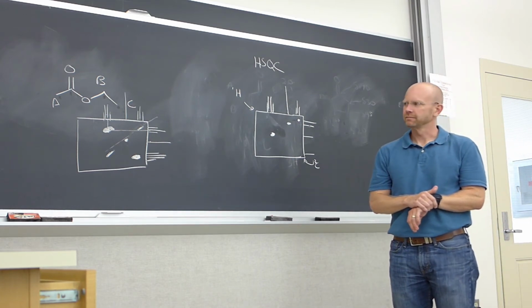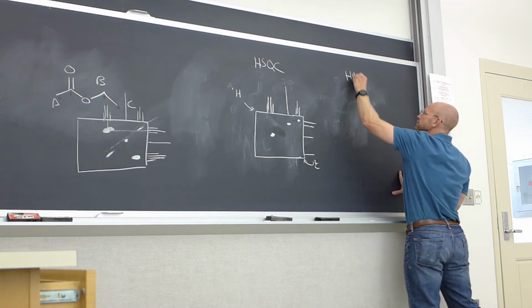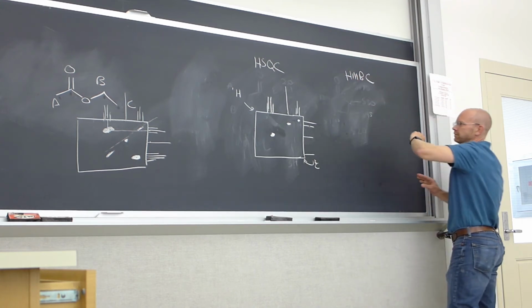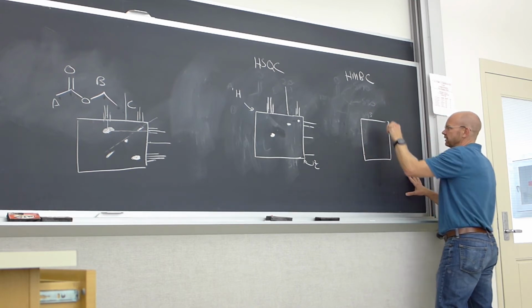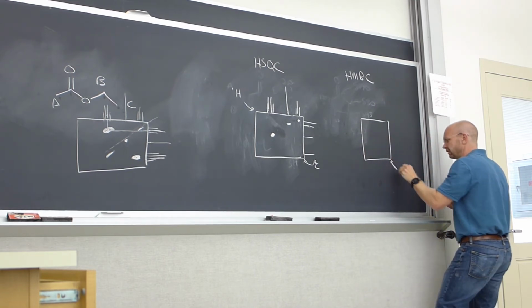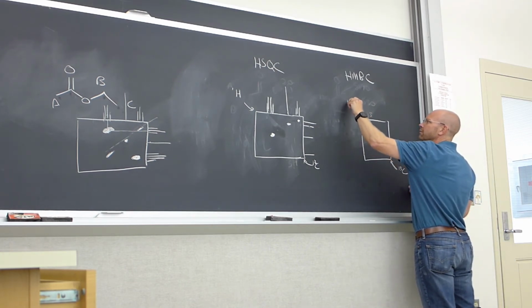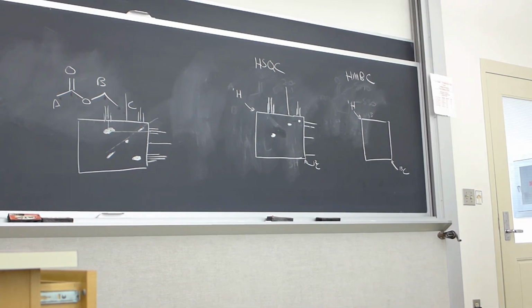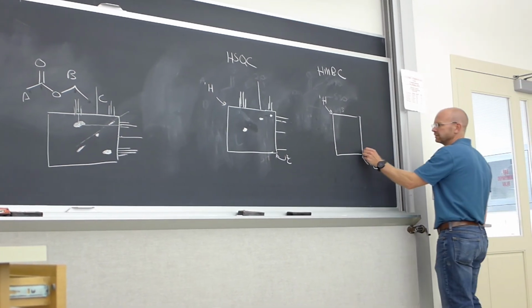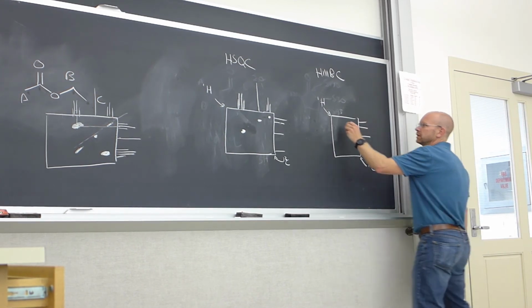HMBC. HMBC is another heteronuclear experiment. HMBC is a powerful tool to determine connectivity. Peyton, you want to read to us what HMBC is supposed to show? It shows 2, 3, or 4 bond coupling between protons and carbon. The number of bonds can be set up in the experiment, but it is by default 3 or 4 bonds between the proton and the carbon. Right.